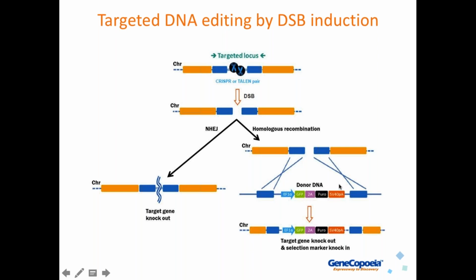And what happens is the double-strand break is repaired by homologous recombination between regions surrounding the break that are identical or nearly identical or homologous. And so the donor, as it's called, functions to repair the break by copying the information from the donor to the recipient broken chromosome.